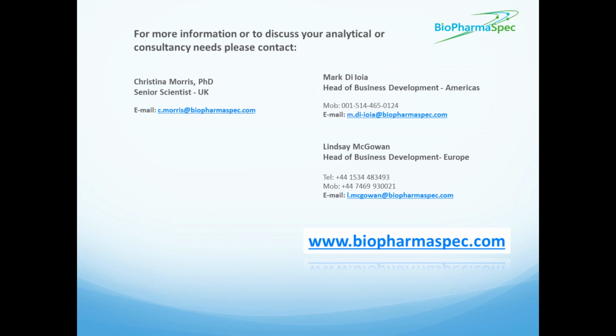The last question for this webcast is, how long does a 2D LC library creation take? The short answer there is that it's product specific. What a 2D LC method will give you is better separation. So it can improve the depth of the reference library. It will screen for the very low level HCPs.